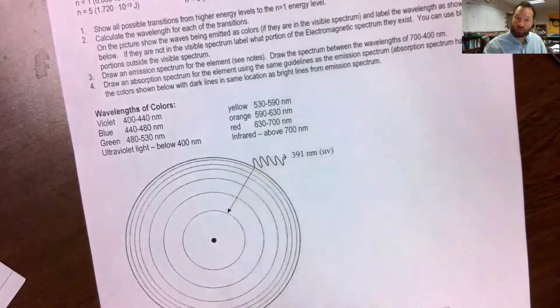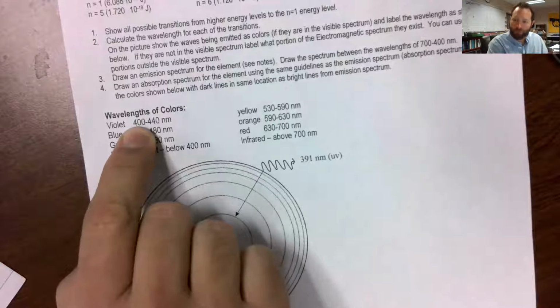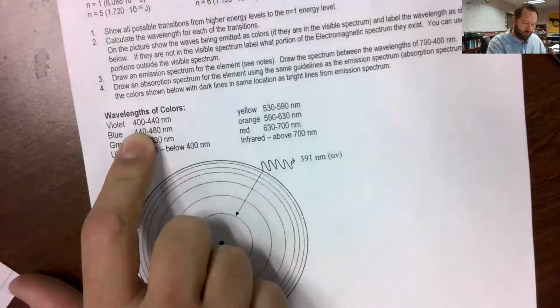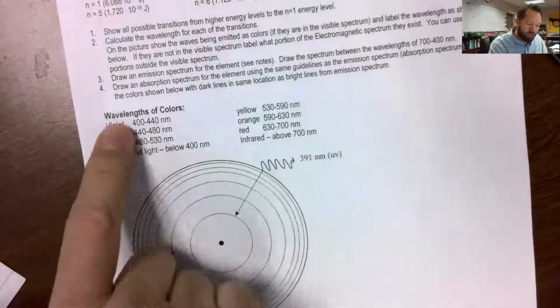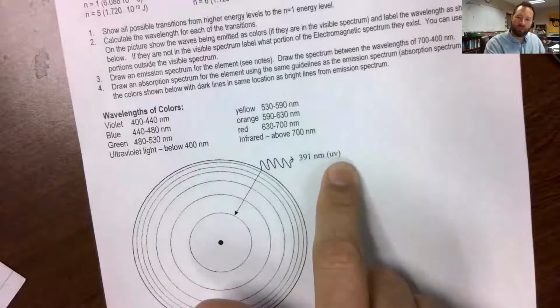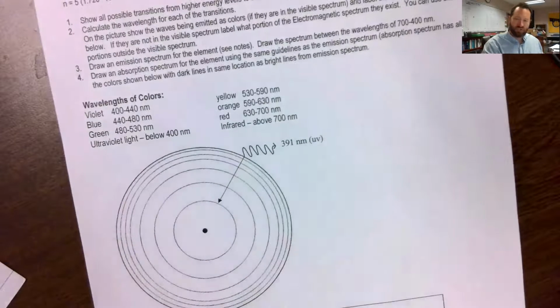It's black, and that's good because if you take a look over here, visible light, what we see, doesn't start until 400 nanometers. 391 is before that, so we wouldn't see it. That would be UV light. So that's good. That's black. We don't actually see it.